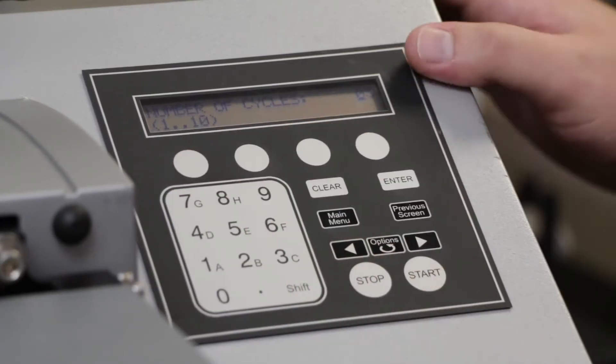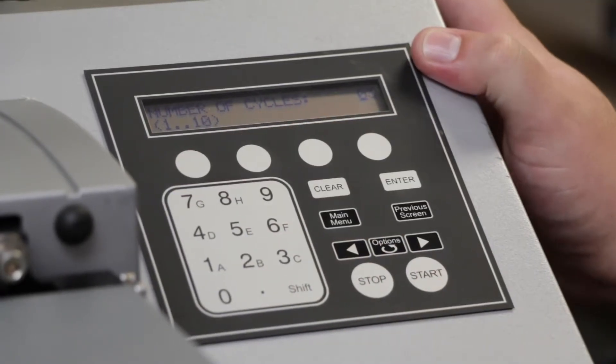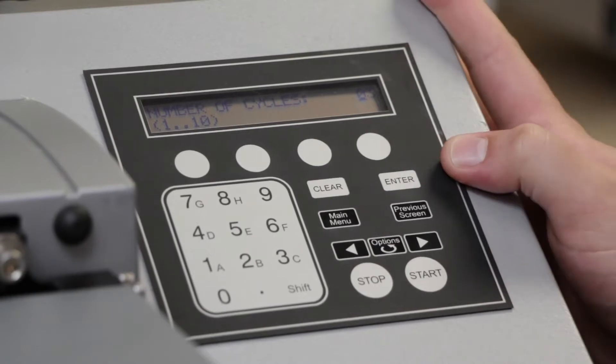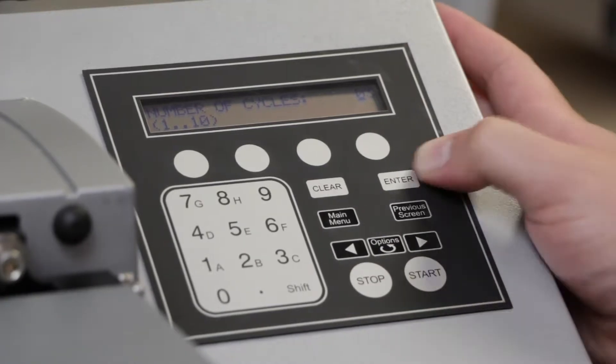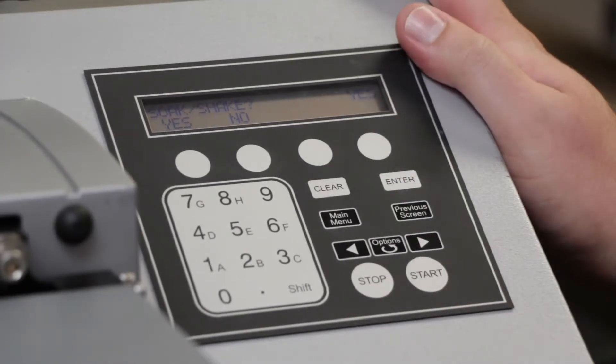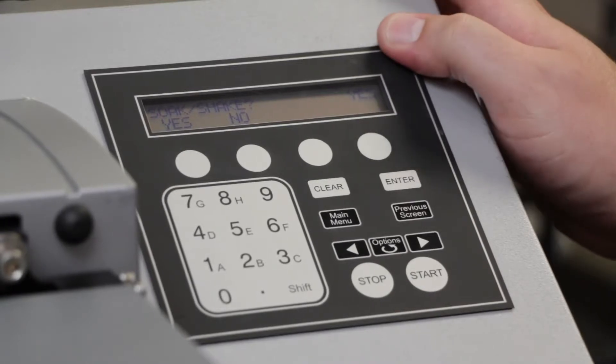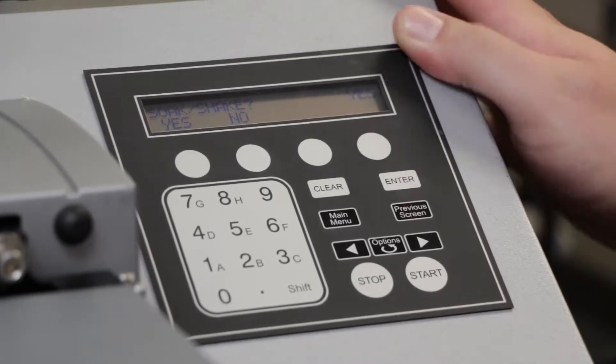Starting with the Method option, we'll define how many cycles we want in our wash, in this case three, and they can be anywhere from one to ten. Next, you're prompted with a soak or shake. In our case, we're going to add both a soak and a shake, so we'll select Yes.